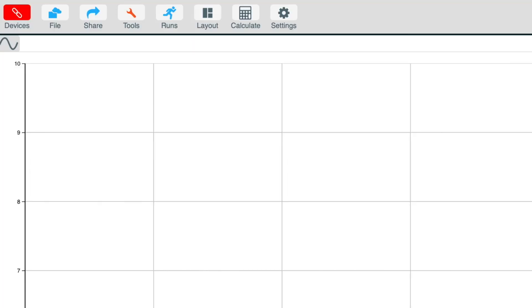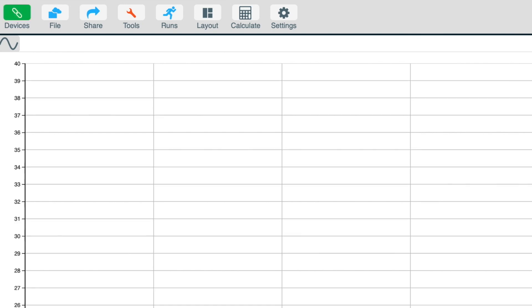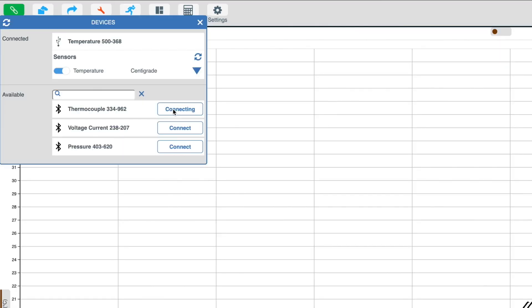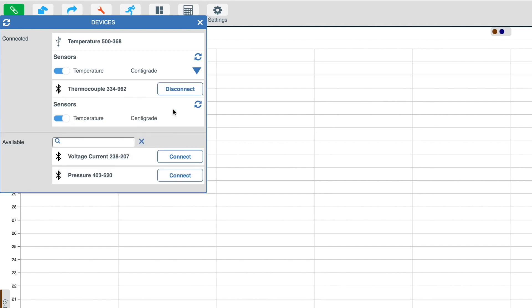You may also notice when devices are connected to the EasySense 2 software that the device's icon will show green. Within the devices panel, you will see a Bluetooth icon, which means that this sensor is connected via Bluetooth, or you will see a USB icon that means this sensor is connected directly via USB.